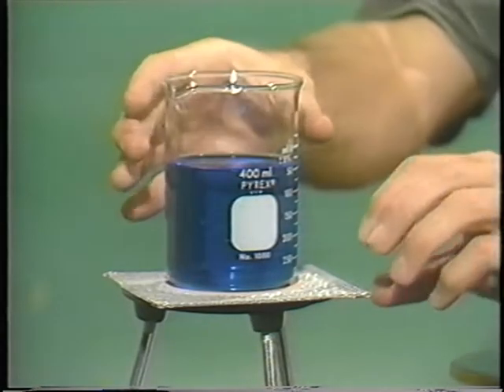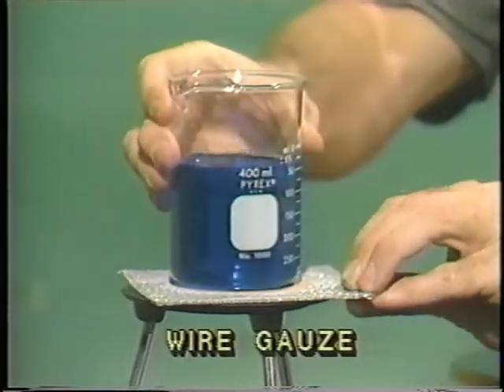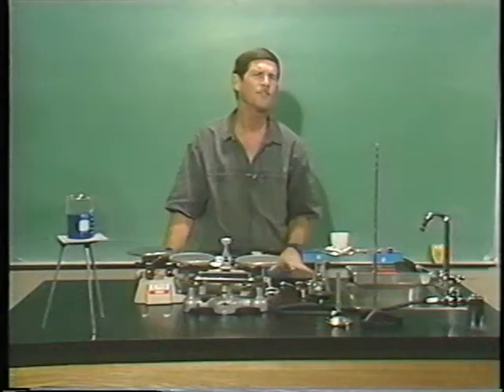Underneath this beaker is a piece of wire mesh with a fiber center. This is used to support the beaker when we're heating it. Then we have a lot of special tools in science. And once again, you want to use the right tool for the right job.